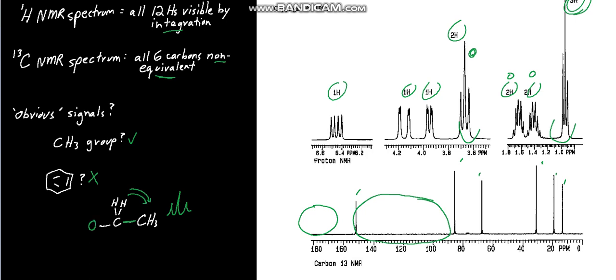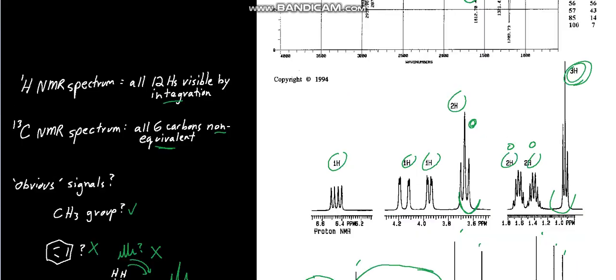You cannot have a CH2 group at that chemical shift, 3.7, 3.6 ppm, without it being next to an oxygen. Notice how this closes this piece off to some extent. What would be the splitting here? It would be 2 hydrogens split 3 additional times. You would expect to see a quartet. Do we see a quartet anywhere? No. So we were on the wrong track on that.